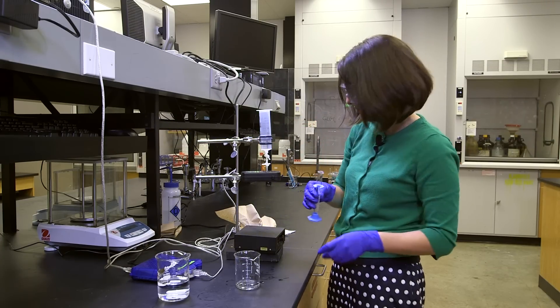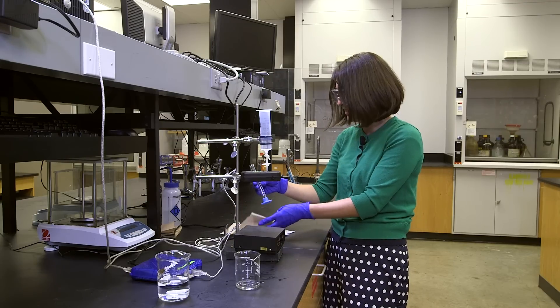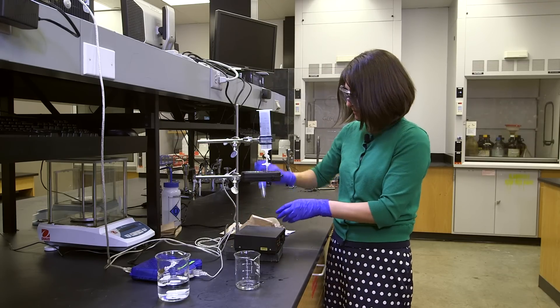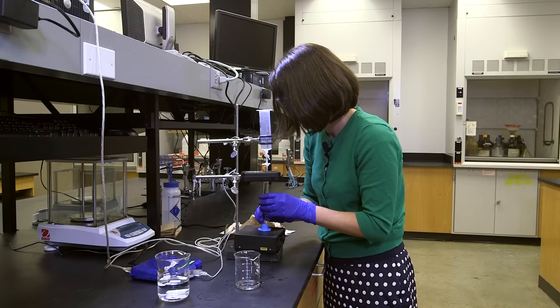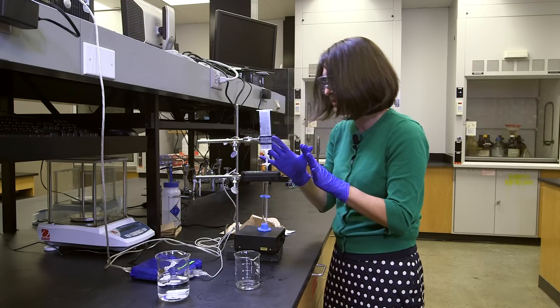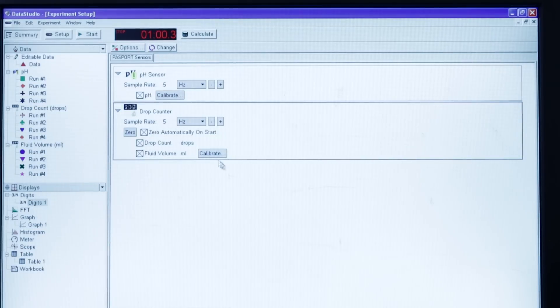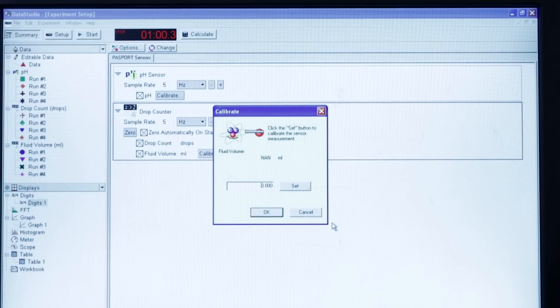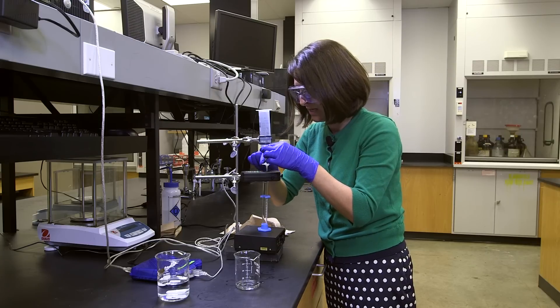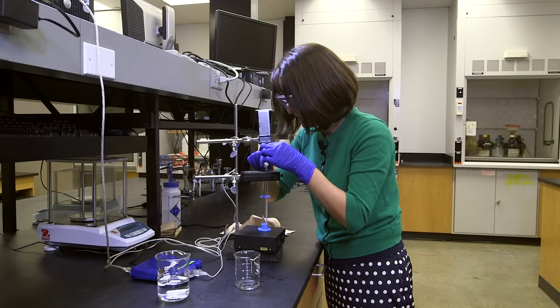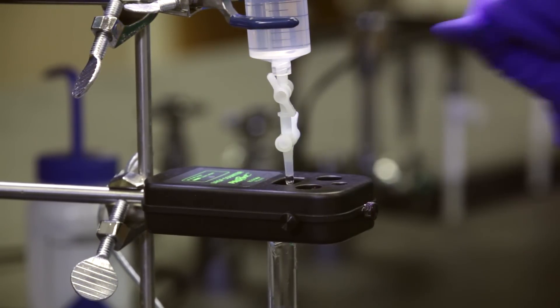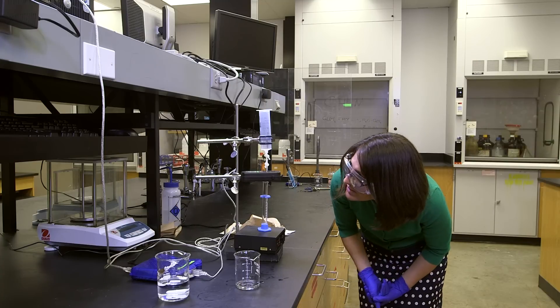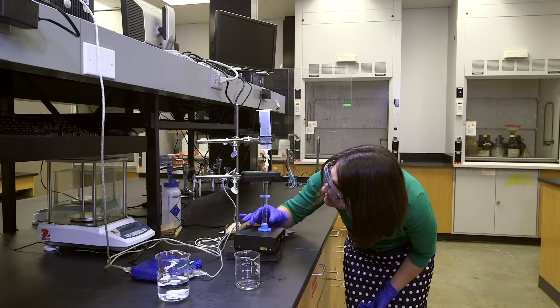I always calibrate my drop counter with just the DI water from that plastic faucet. All right, I'm going to try that again. My drip rate is still good. So I'm going to click calibrate. And then I'm going to turn it on using my bottom stopcock only. Make sure that those drips are being caught in the graduated cylinder.